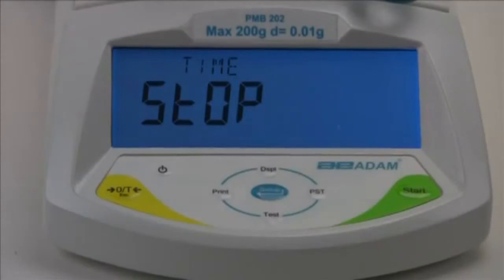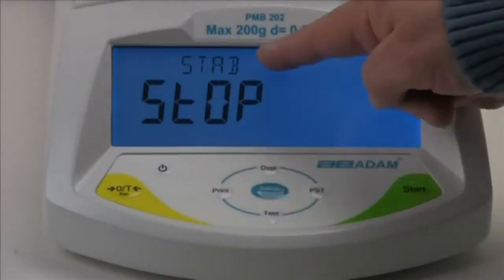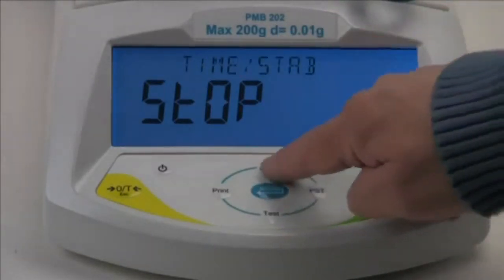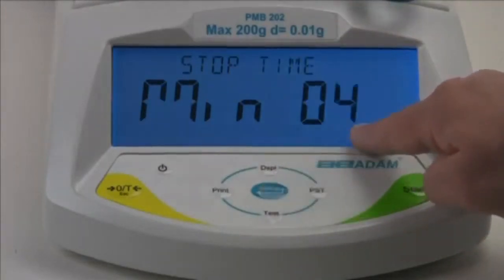Next, we will select a stop condition. The test can be stopped automatically after a set time, or after the sample is stable, meaning weight loss has virtually ended, or a combination of these. For our demonstration, we will run the test for 4 minutes, then stop.